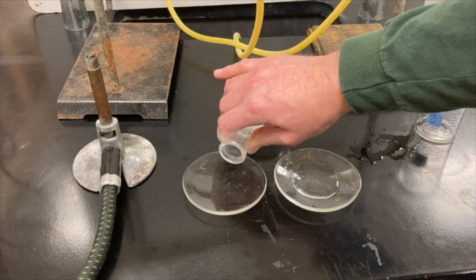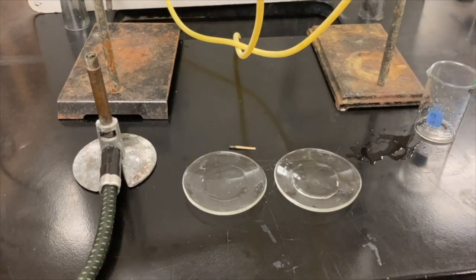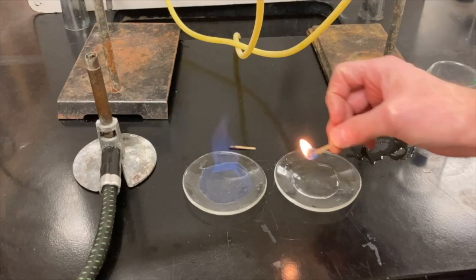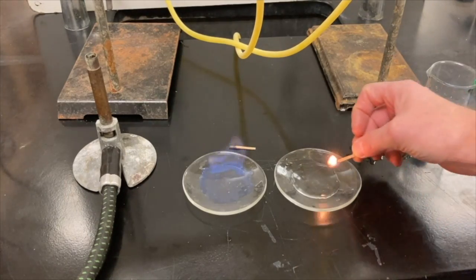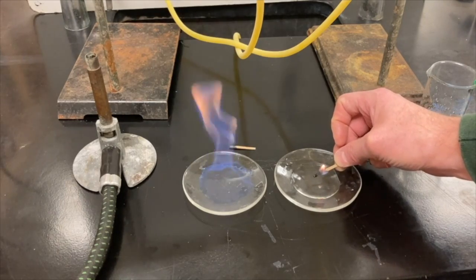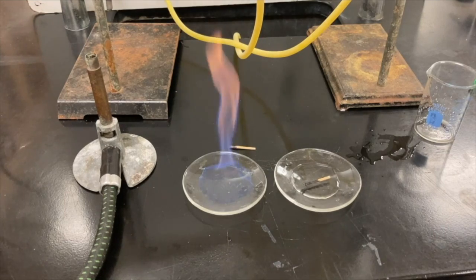And this is the stuff that was in the output flask before I stopped the distillation, which I suspect was ethanol, and it is because it lights. Now let's see if the other substance will light. And I put my match right down there, nothing happens. In fact, I can just drop the match right in there and it would never light on fire.